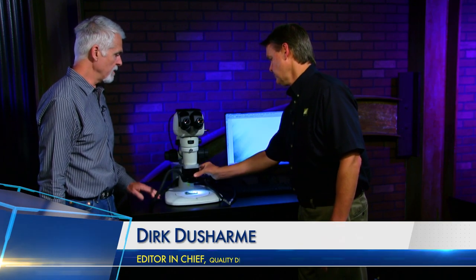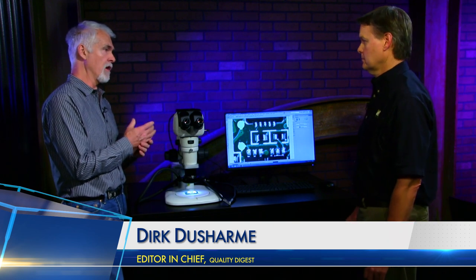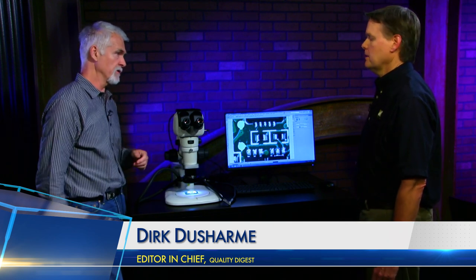Is auto focus one of the options on any of these models, or is it strictly manual focus? Strictly manual focus. You can get motorized focus on the higher-end stereoscopes—motorized in that you have a control, but it's not auto focus. The depth of focus for stereoscopes is too large for auto focus to work effectively.